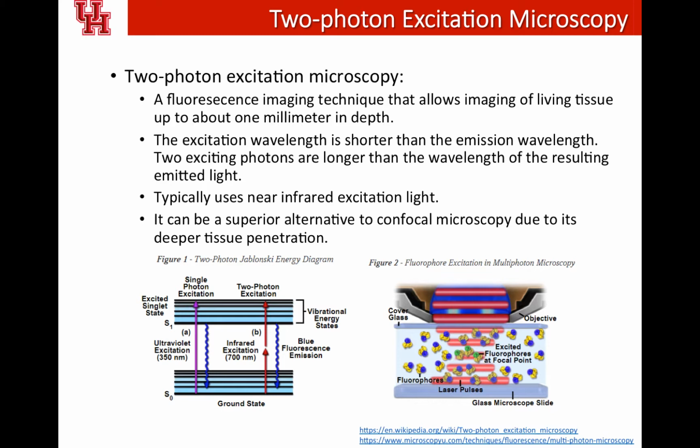So that's why it's called two photons. You have to use two excitation photons, and both of them shine onto your molecule at the same time, and both are absorbed by your molecule at the same time. So that's the two photon excitation, and then you get much more energy to excite your molecule.